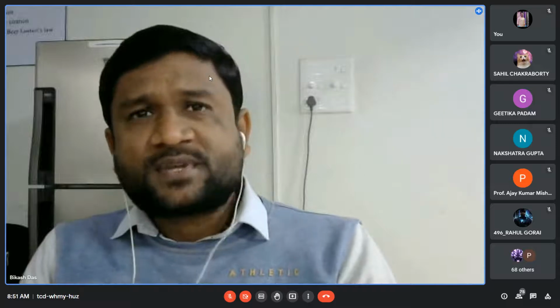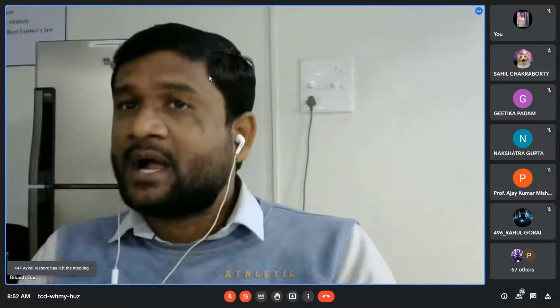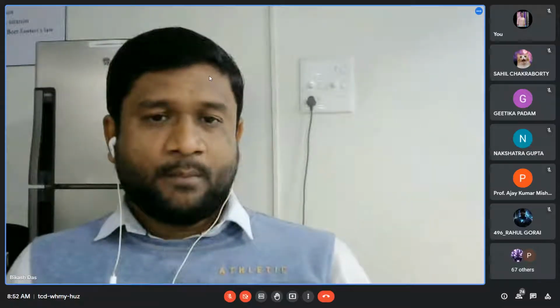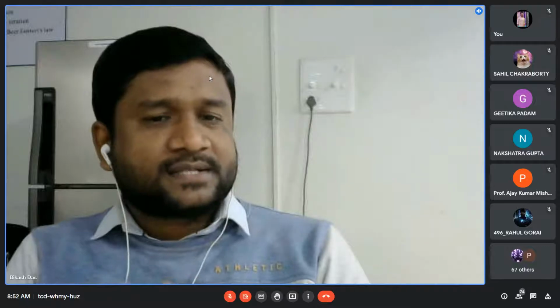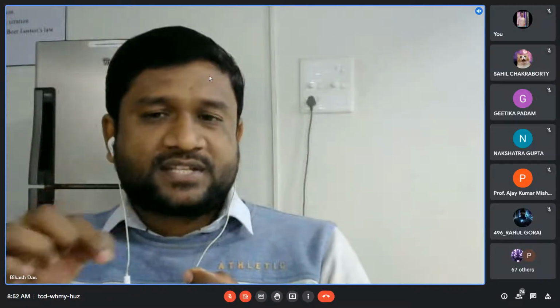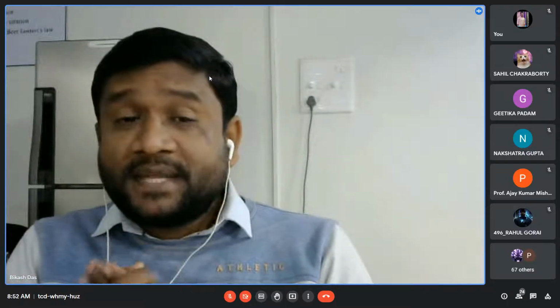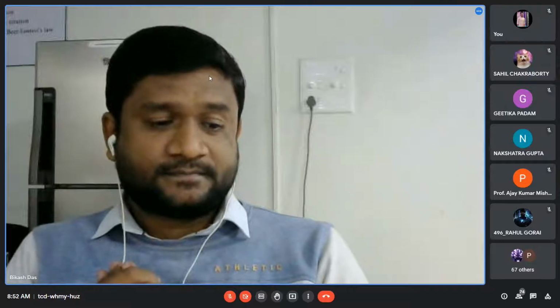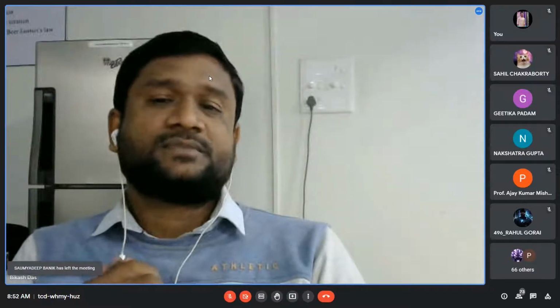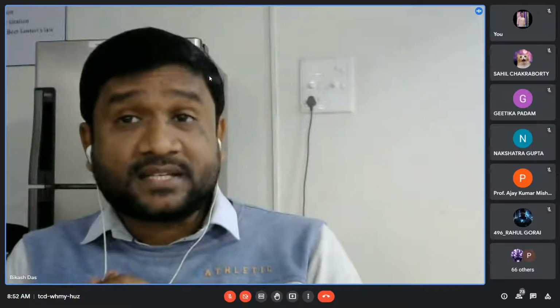Once all the H+ ions have completely reacted with OH- ions to form H2O, that will be our minimum conductance. But after reaching minimum conductance, if you continue adding NaOH, then due to the unavailability of free H+ ions, the conductance will start increasing due to OH- ions.